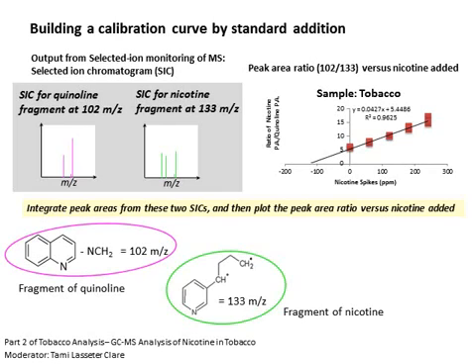While ideally, in a standard addition experiment, you should get nicely clustered data points at each added concentration, unfortunately we don't get such nice data from this experiment because of some inherent irreproducibility in the experiment. So to get around this, we use an internal standard of quinoline, which is chemically somewhat similar to nicotine, making it an acceptable internal standard.